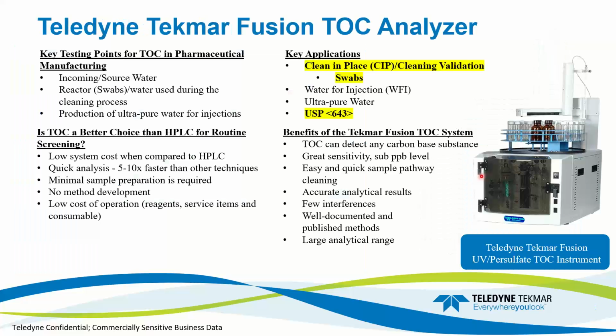So this is kind of a high-level view slide that we're going to be looking at today. So the key testing points for TOC in a pharmaceutical manufacturing process are what? We're going to be looking at incoming / source water. We're going to be looking at the reactors and waters used during the cleaning process, and the production of ultra-pure water for injection.